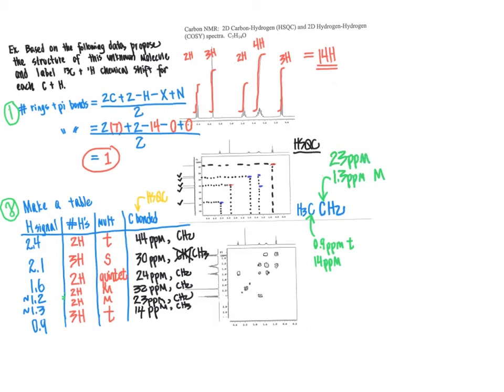The reason why I plugged this CH2 as the one at 1.3 ppm rather than the one at 1.2 ppm was because when we looked at this tiny little region of the COSY spectrum, it looked like our signal following the axis here was a bit more downfield than the nearby signal, indicating this was the 1.3 ppm signal rather than the 1.2 ppm signal. So we've got our second piece here.